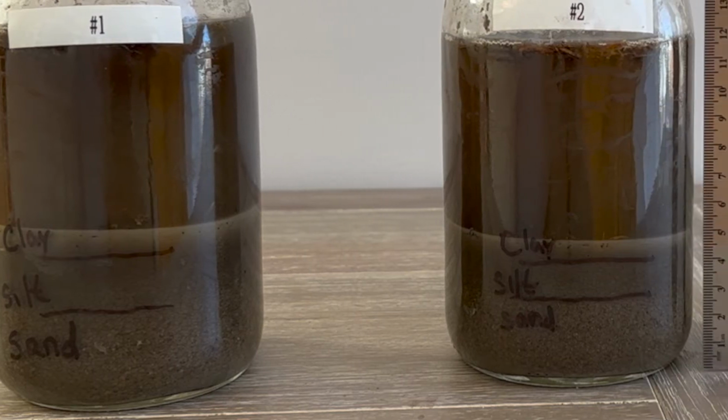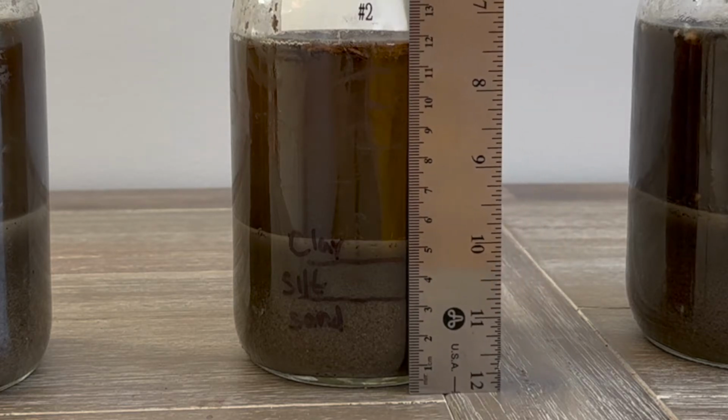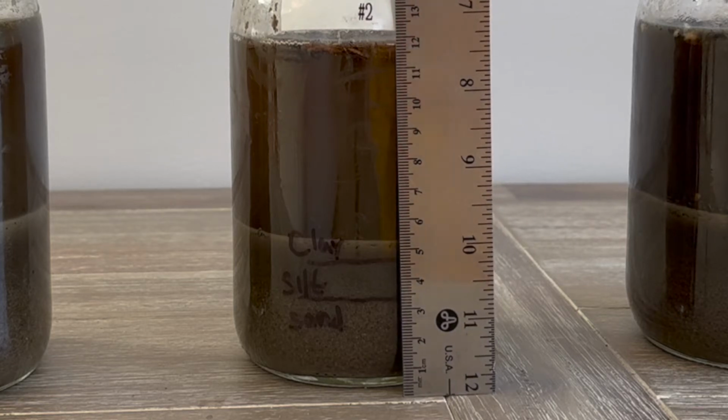Moving over to the second sample, we've got a total of 51 millimeters. Looking at the different layers, we've got 33 millimeters of sand, about 12 millimeters of silt, and about 6 millimeters of clay.